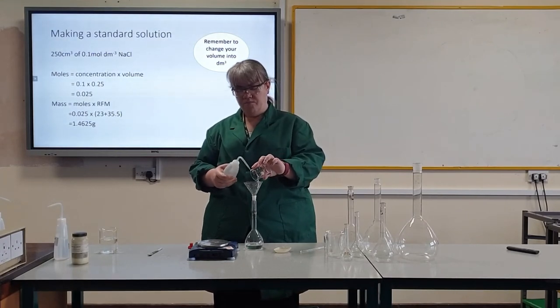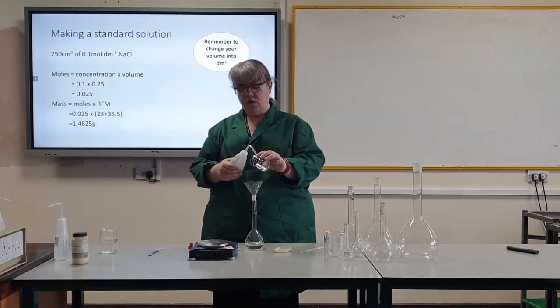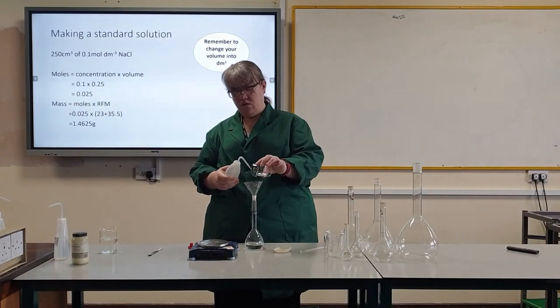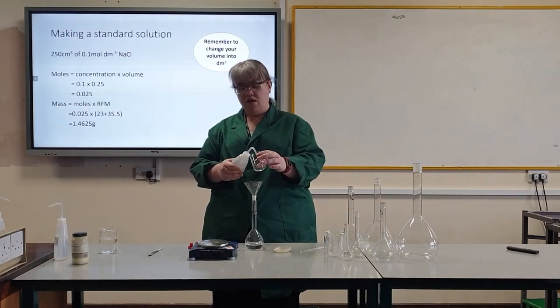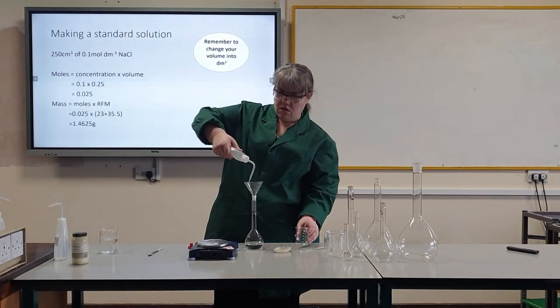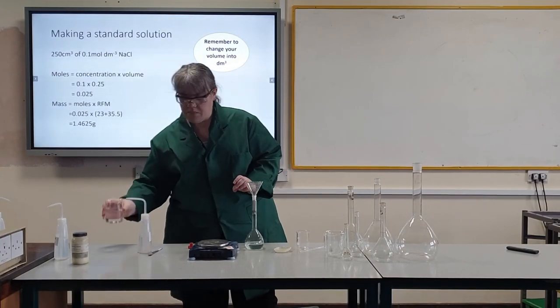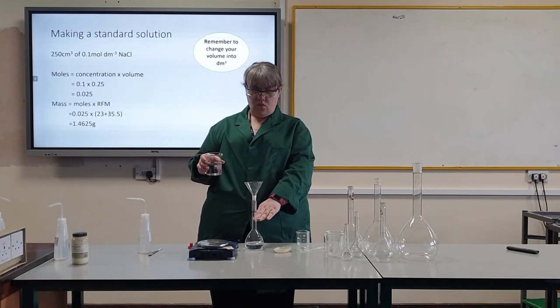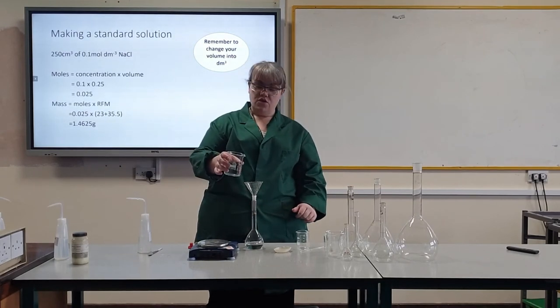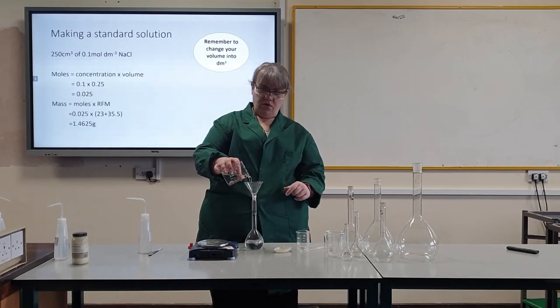I rinse out the beaker with a wash bottle, and I do it three times just to make sure. Now I am going to put in distilled water so it is just below the 250 cm³ mark on the neck of my volumetric flask.